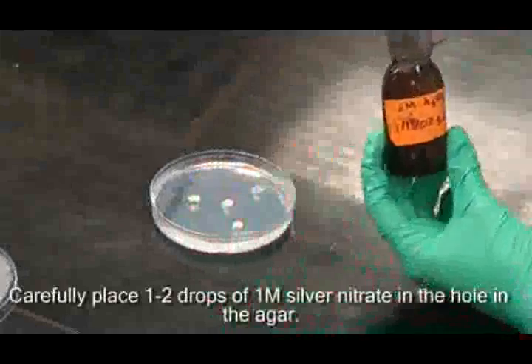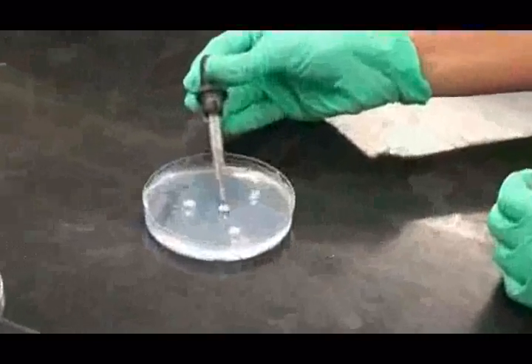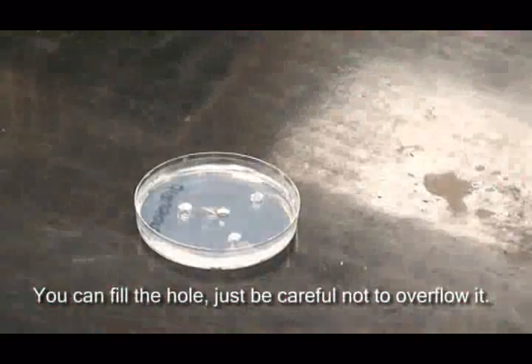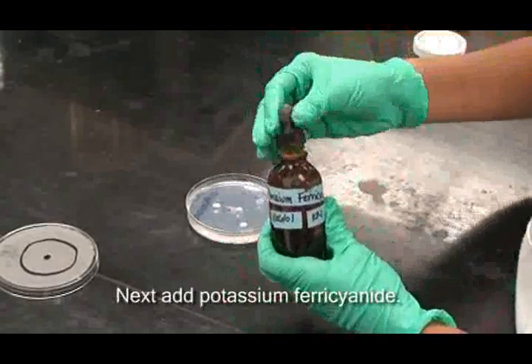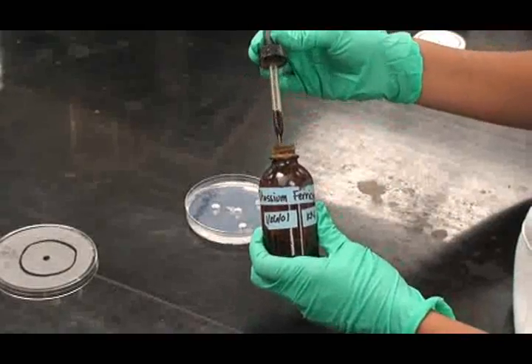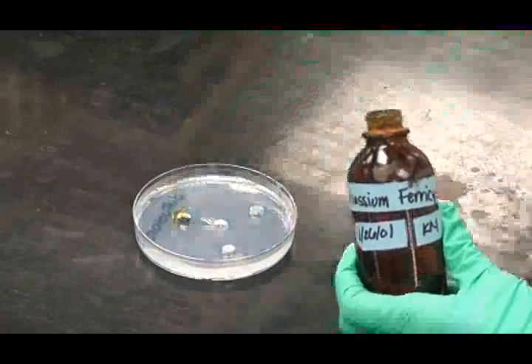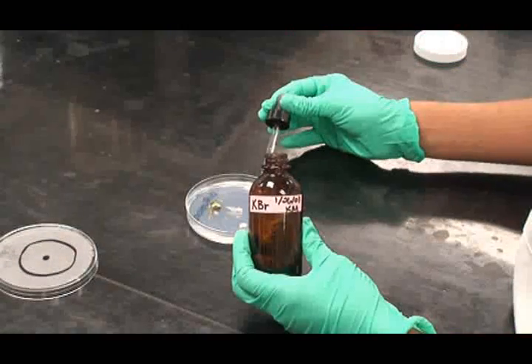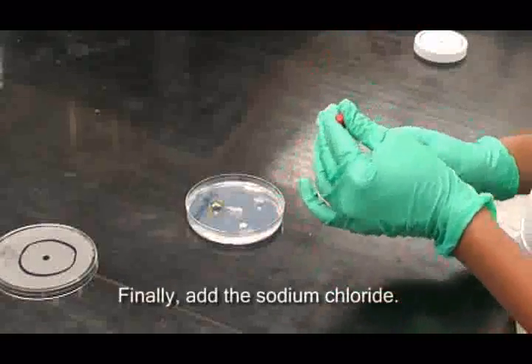Carefully place a drop or two of 1 molar silver nitrate in the center hole in the agar. You can fill the hole, just be careful not to overflow it. Next, add the potassium ferrocyanide. Add potassium bromide in the same manner. And finally, the sodium chloride.